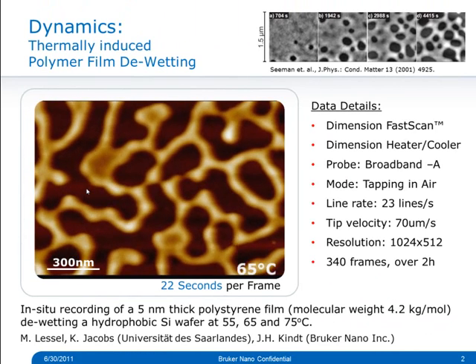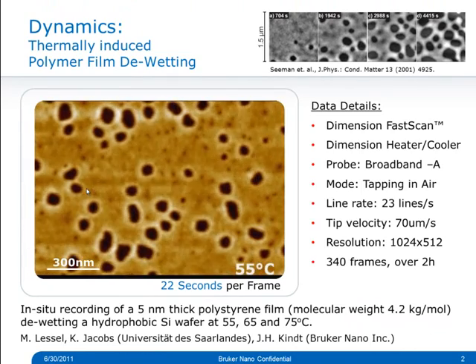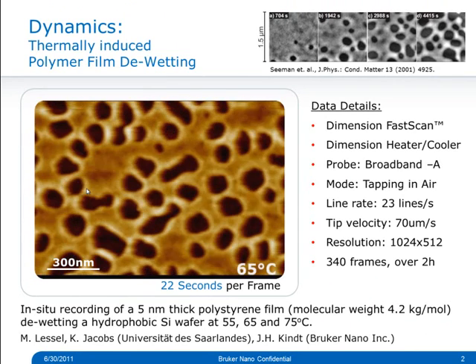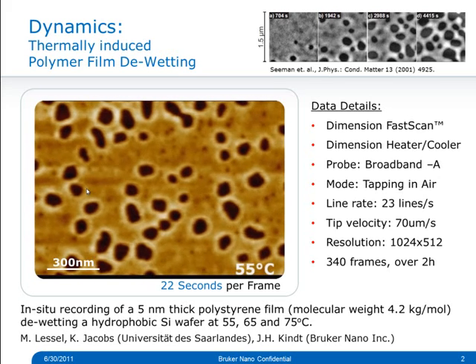You can see in the movie how good our control over the process is through the control of temperature, and how critical in general controlling the process is to observing dynamic processes in an AFM. On the right hand side, the details of this movie.